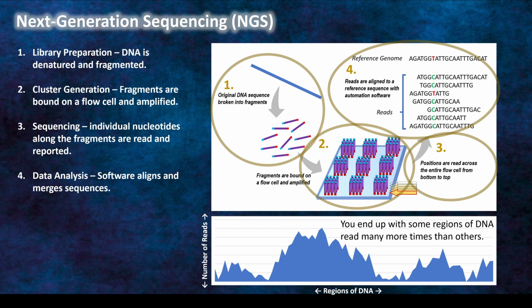So with next generation sequencing, you're taking very small pieces and you're trying to put it all together. The end result is you do have a massive puzzle. Again, I go back to the analogy of trying to put a puzzle together. You've got millions of different little pieces here that you're trying to align after the read process is done, and that's mostly done with software, and it's a piecing algorithm that puts it together, usually against the reference genome. Again, the picture on your puzzle box allows you to get more quality in terms of putting it back together. But this is a whole software process. You get massive amounts of data, and then the software has to put it together.